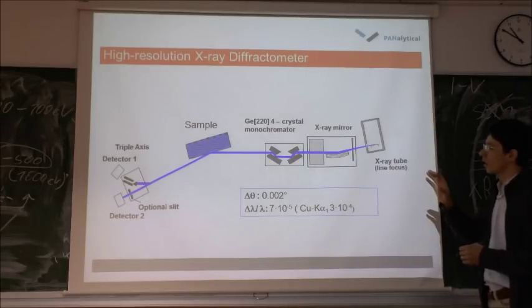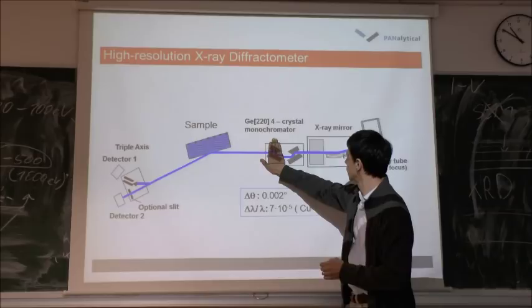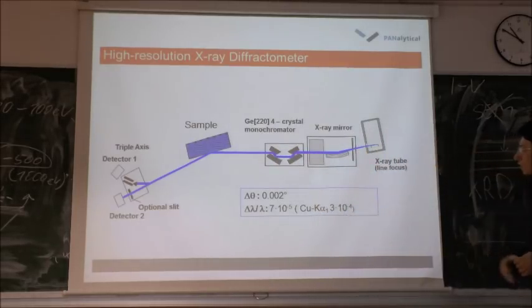So in our configuration, we have it like this. Yeah? We don't have 4-bounce crystals, but we have 2-bounce crystals. Actually, there is a certain trade-off. If you have a configuration like this, you drop the intensity dramatically. So if you want to get anything out of your sample, you have to collect data the whole day. But then it's very high quality data. But we also do, let's say, powders for not very routine samples. For routine samples we have another diffractometer, but let's say for slightly better data processing.